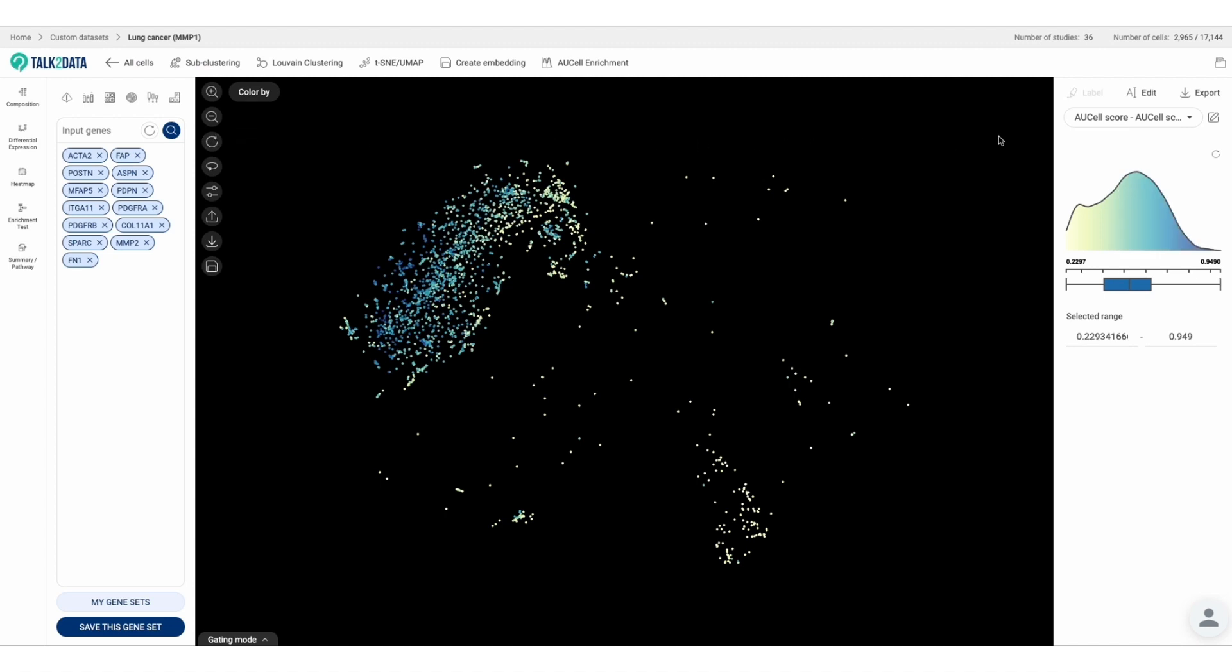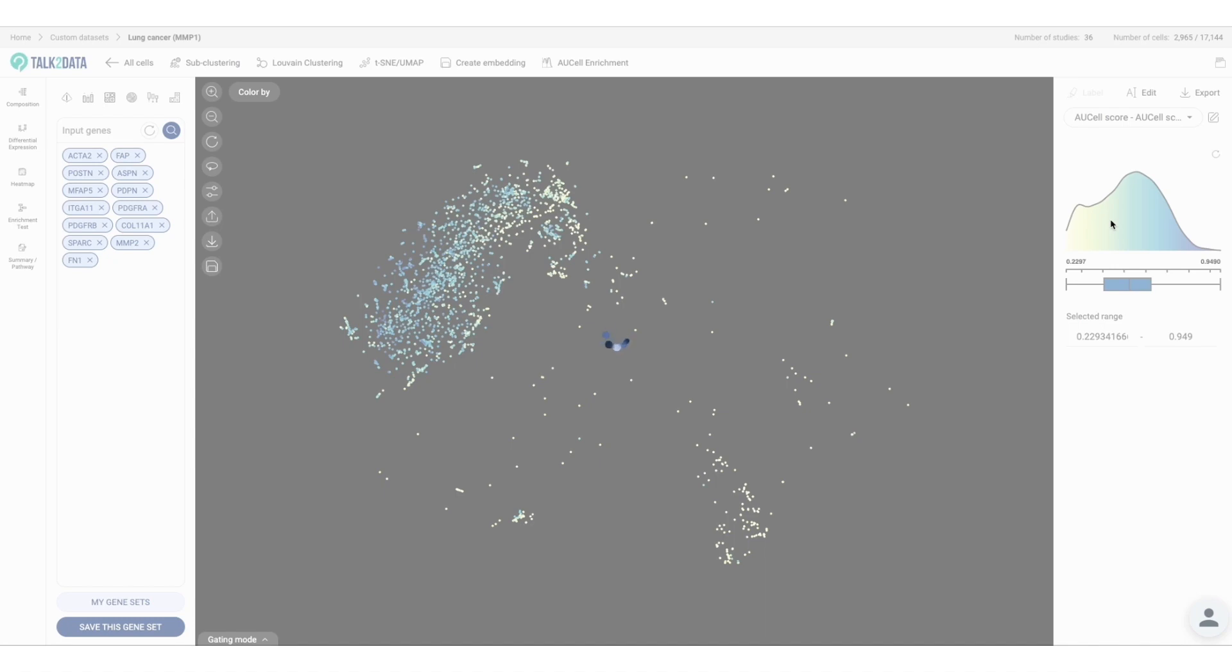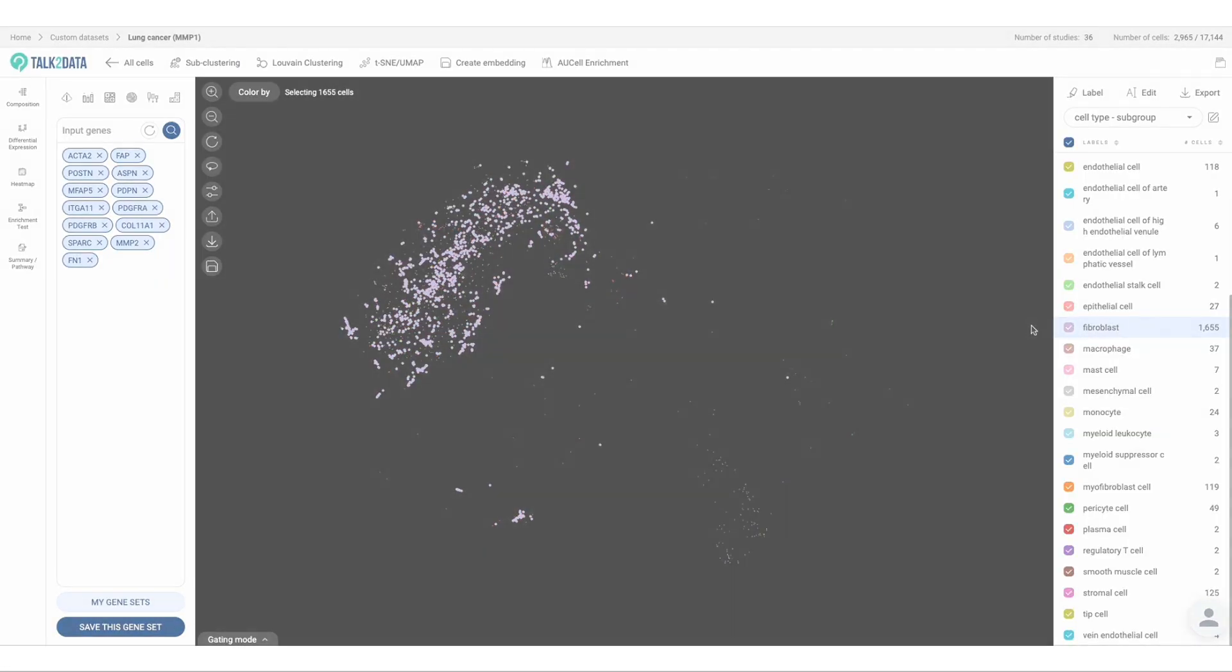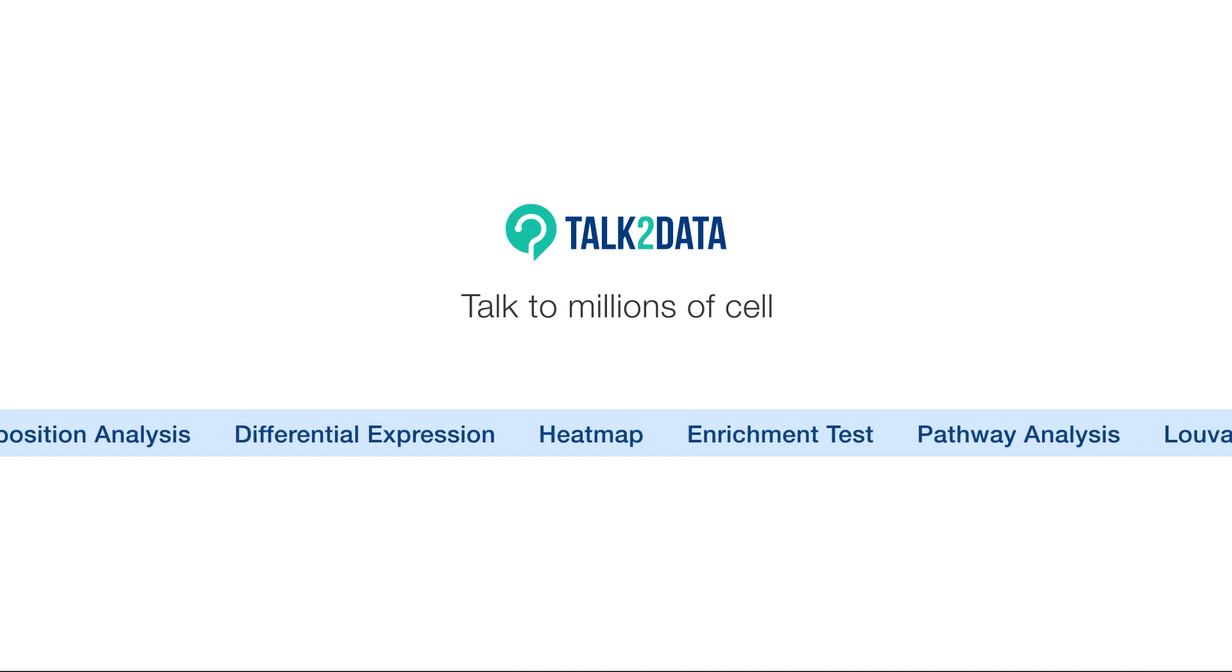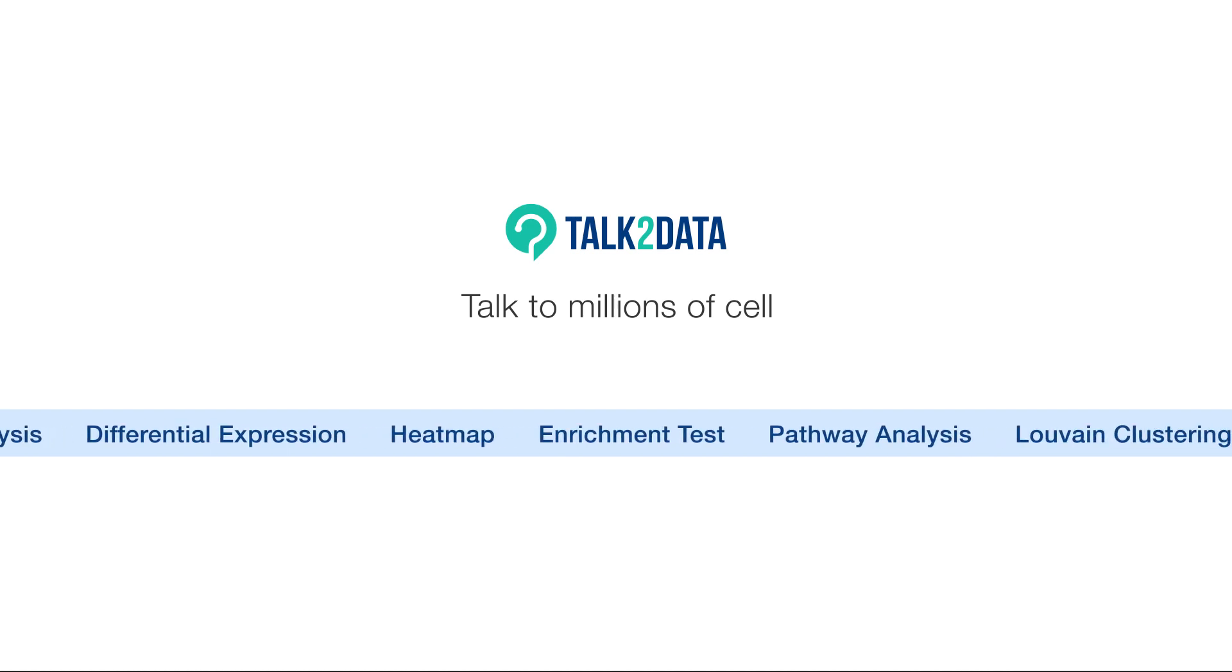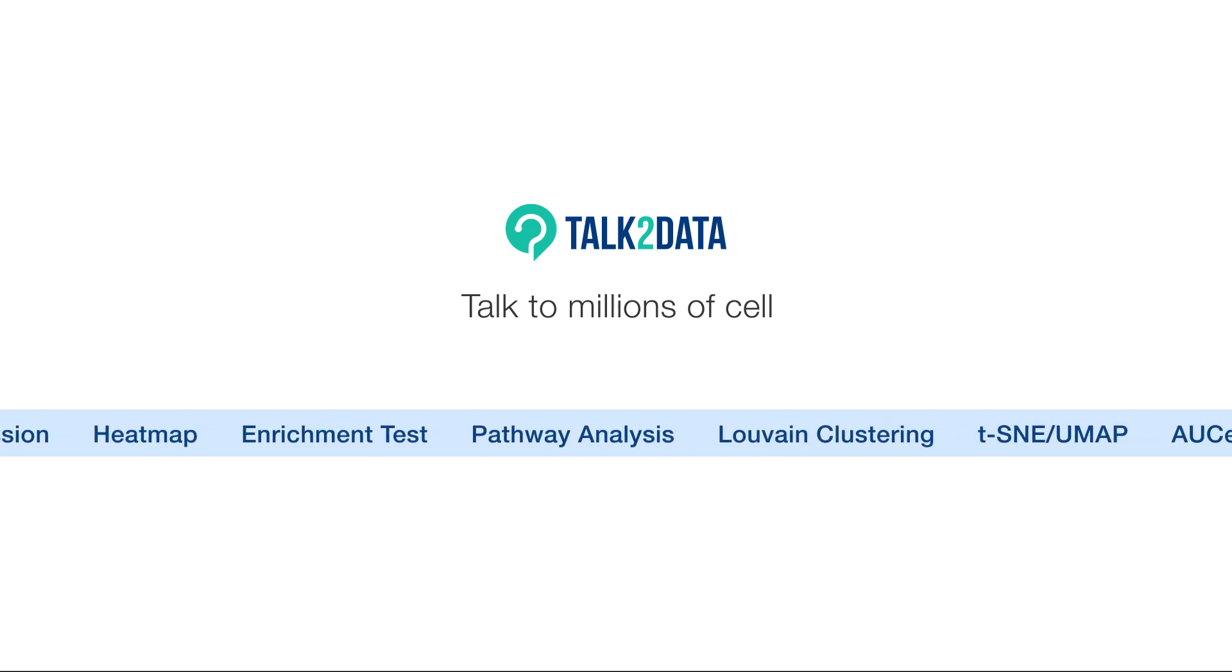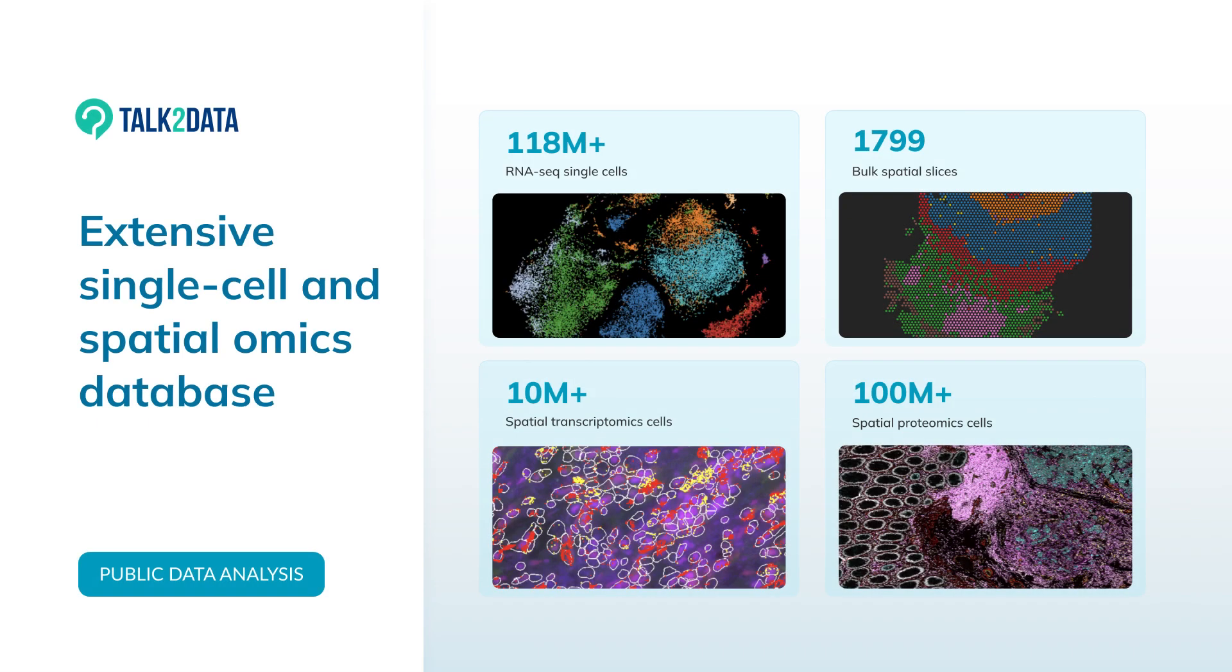Easily and quickly, you have your initial analysis of cancer-associated fibroblasts (CAFs) presence in your lung cancer cell population. By using Bioturing's Talk2Data platform, your monthly data curation and analysis is now cut short into a few seconds or minutes with just a few simple clicks.